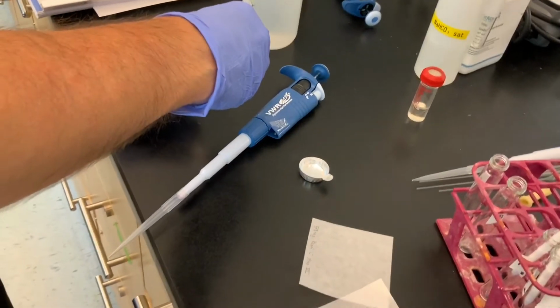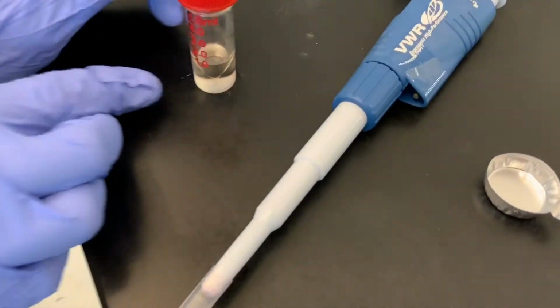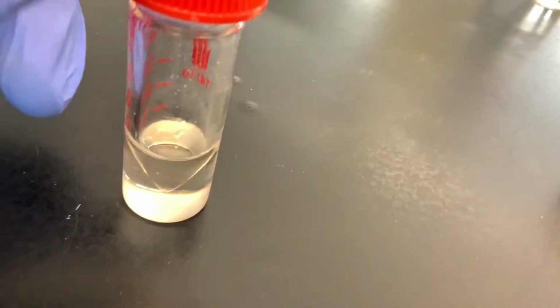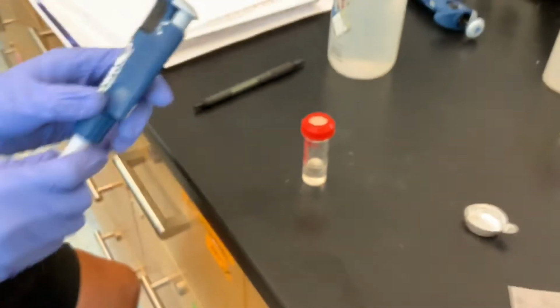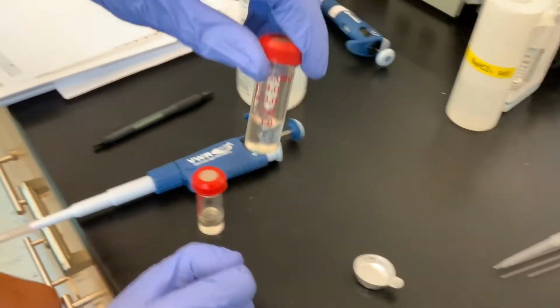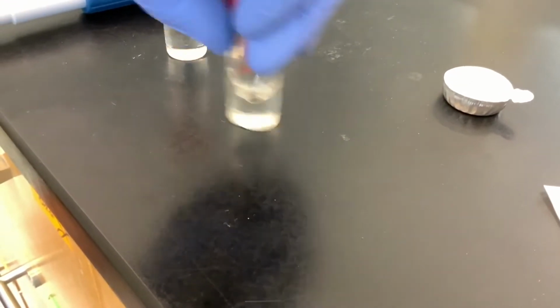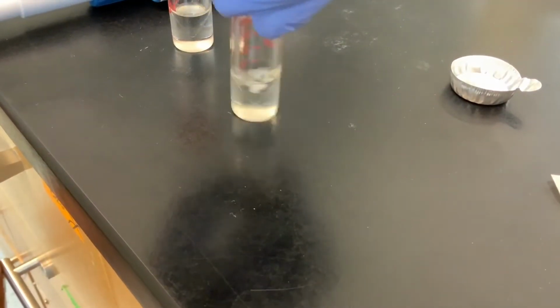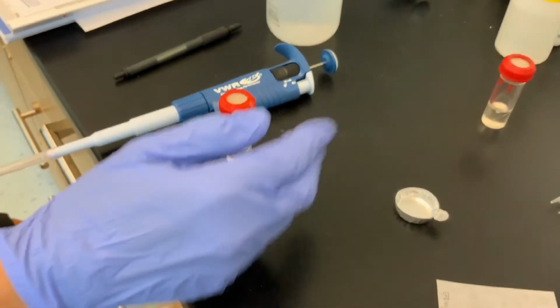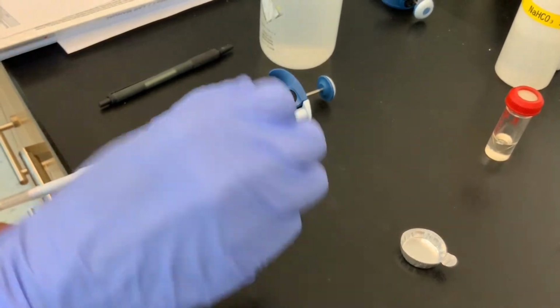So part A, all the benzoic acid now you can see has been completely dissolved, right? We no longer see any traces of that white solid. And so now we're ready to go ahead and add the 600 microliters of distilled water. Let's also look at part B. Has that piece dissolved? No, because we weren't stirring it. So that larger chunk of benzoic acid in part B has not completely dissolved yet. And so that, of course, will take longer to dissolve because it's a larger piece of benzoic acid.